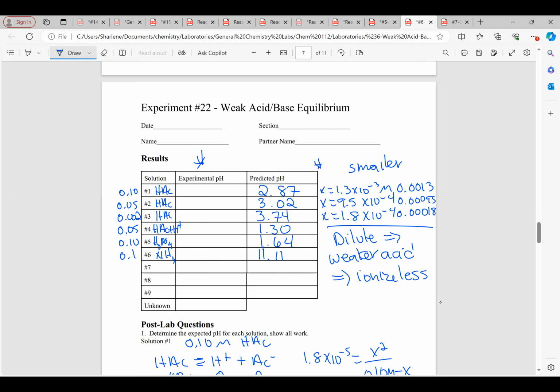All right. Does anybody have their lab from last time? Because I had you take the pH of 0.1 molar ammonia. Does anybody have that data that we could compare to? I think we have some. Give us just a second.